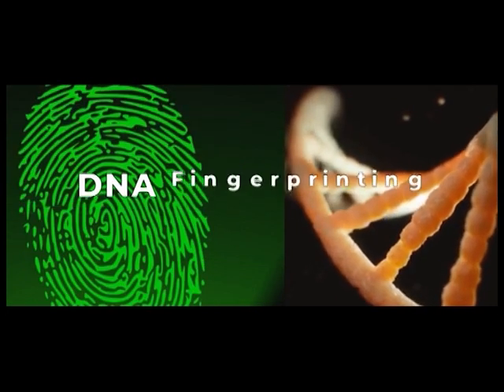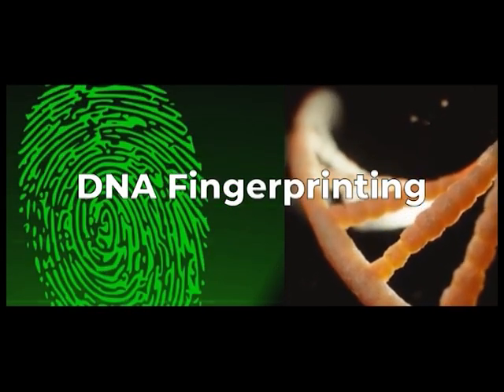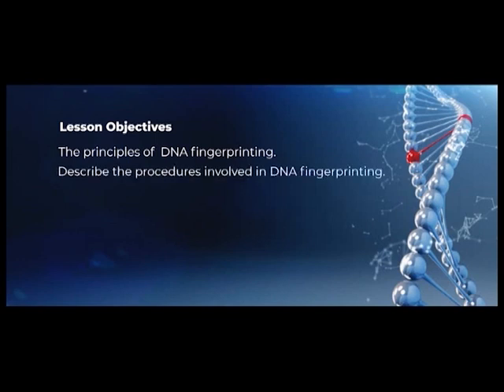Now, to proceed with what makes the DNA fingerprints look different, or how do we actually identify those differences, I have the topic, and this is the main focus for today, and that topic is DNA fingerprinting. Today we are going to learn about DNA fingerprinting, and by the end of this session, I would like all of us to know three objectives. First of all, the principles of DNA fingerprinting. The second one is we should be able to describe the procedures involved in DNA fingerprinting. And finally, why do we learn something, especially in biology? We learn something just to get some applications, and we learn that topic to apply it in our day-to-day lives.